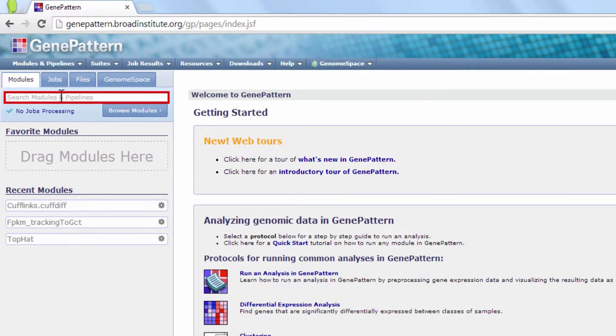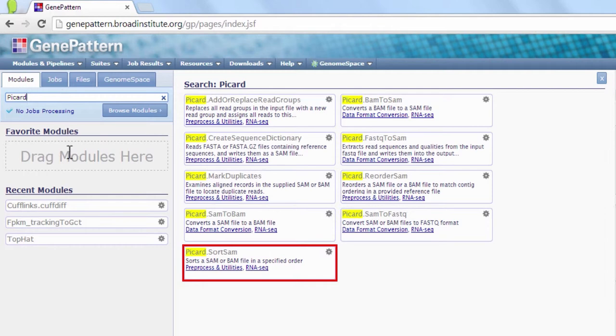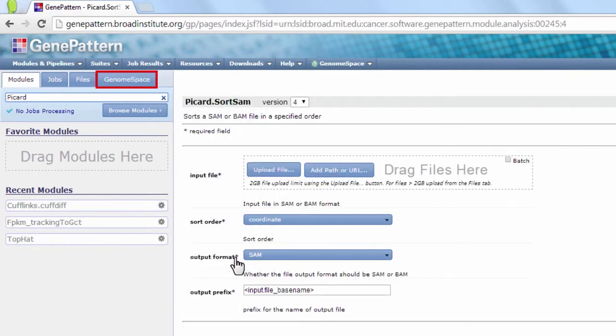From the GenePattern homepage, find the module Picard Sort Sam using the module search bar. Click the module to get started.